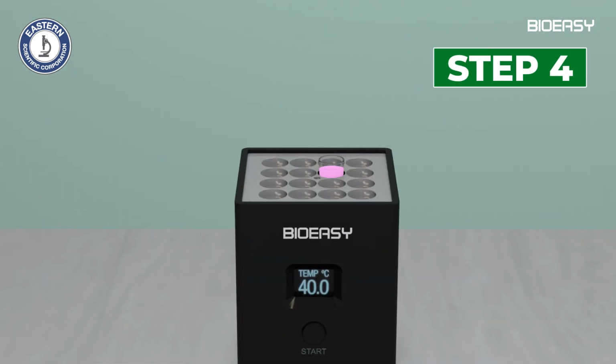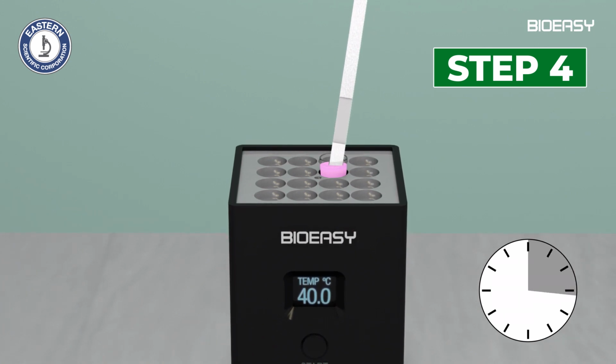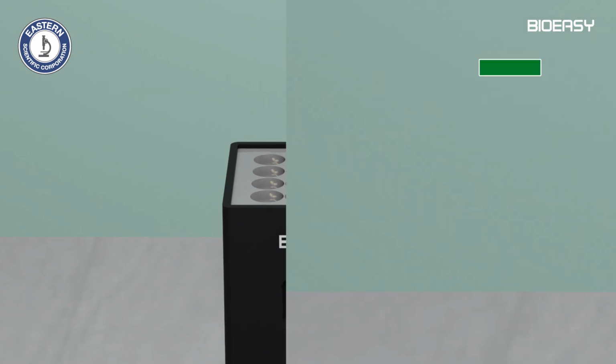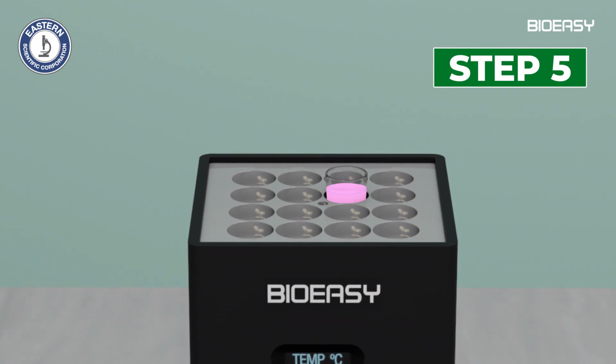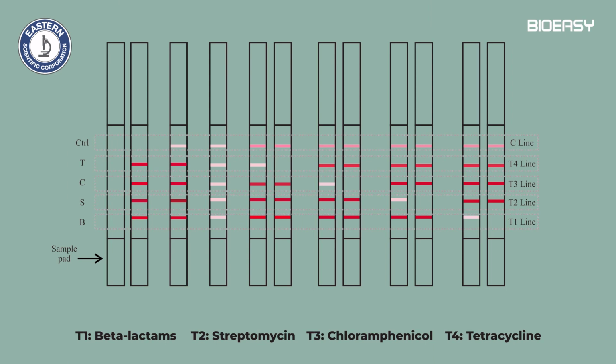Step 4. Insert the dipstick into the microwell after first incubation. Incubate another 7 minutes at 40 degrees Celsius. Step 5. Take out the dipstick from the microwell and remove the sample pad at the lower end and interpret the result. Compare the color intensity of test line or T line and control line or C line and interpret the test based on chart.